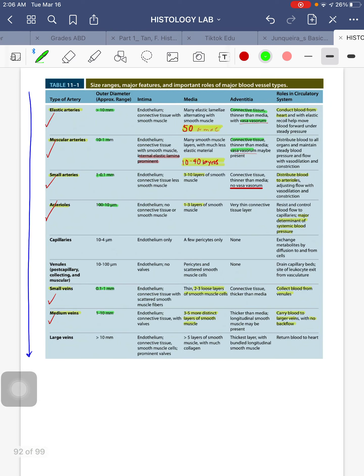Now we will go to the blood vessels. To make learning easier, use this table as a guide, because what we really want to identify is the number of layers of smooth muscles — that's one of the ways to distinguish an elastic artery from a muscular artery. The elastic artery has a diameter of more than 10 millimeters, with more than 50 alternating smooth muscle layers with elastic lamellae. In the adventitia layer, there is vasa vasorum.